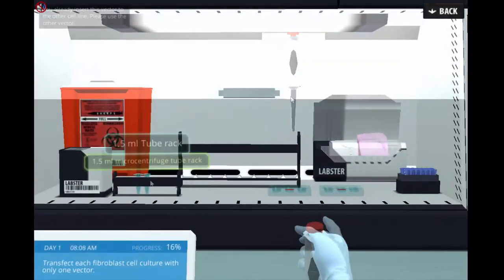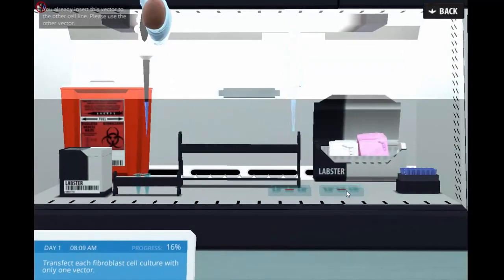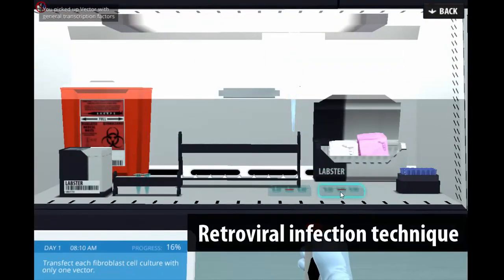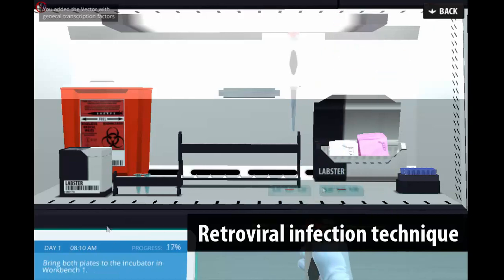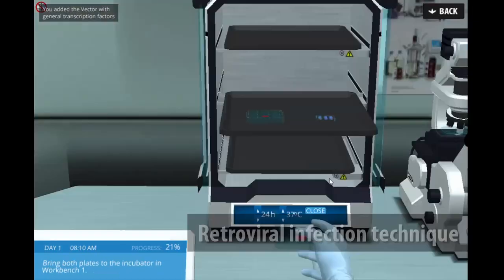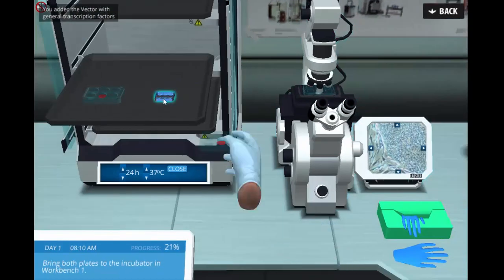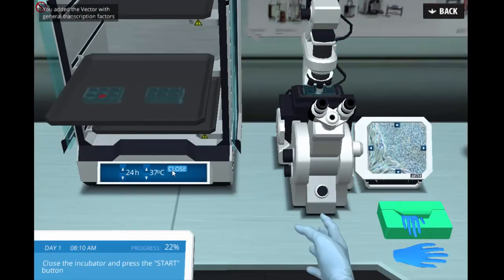After identifying these genes, students use a retroviral infection technique to transform mature fibroblasts into iPS cells.